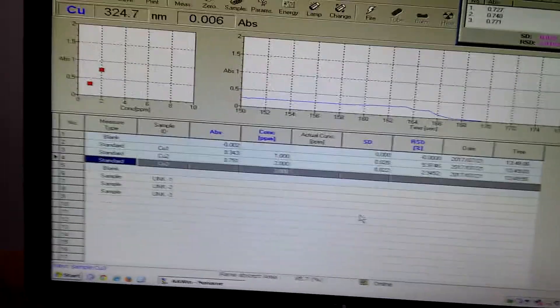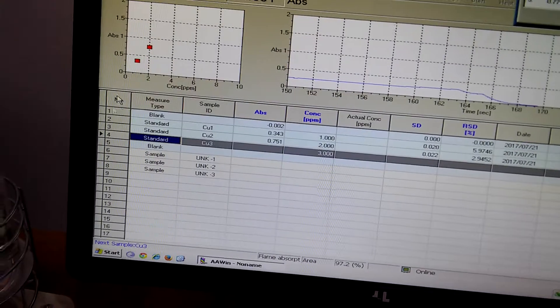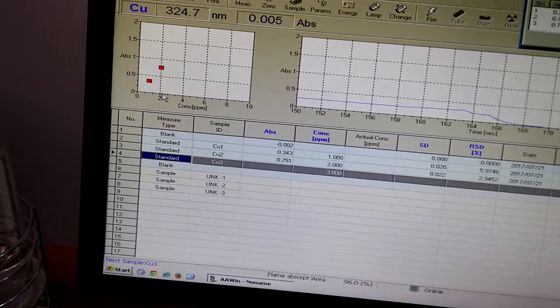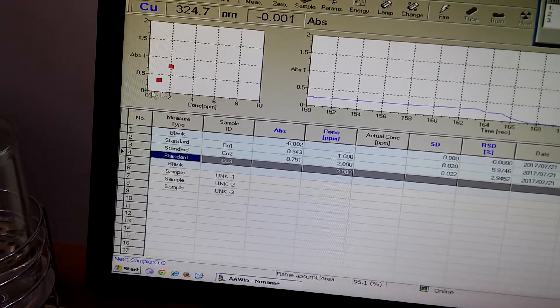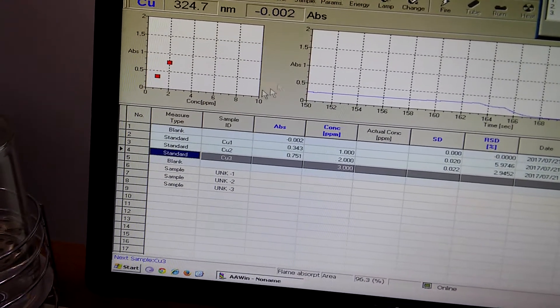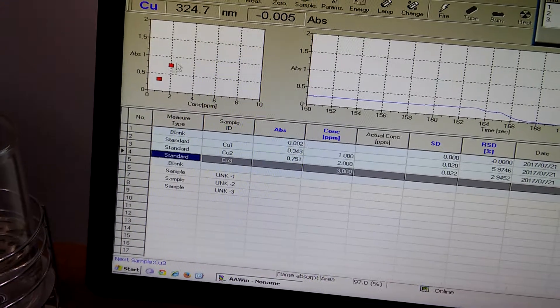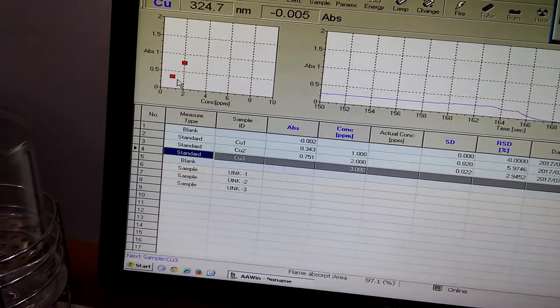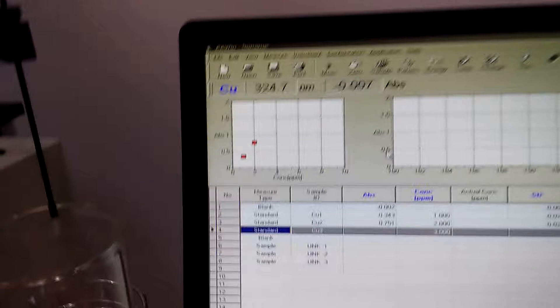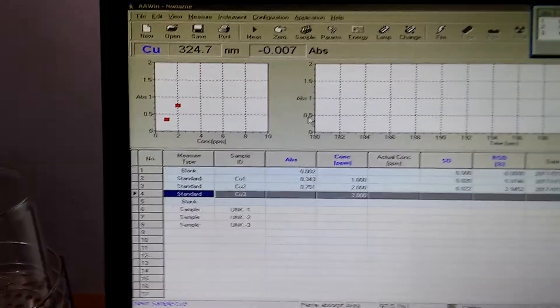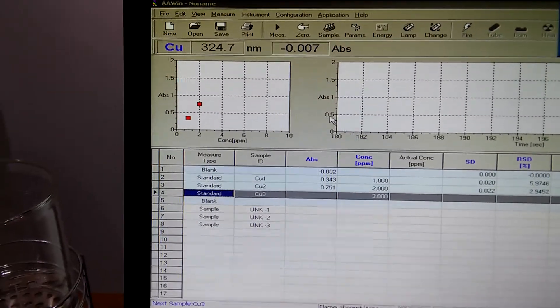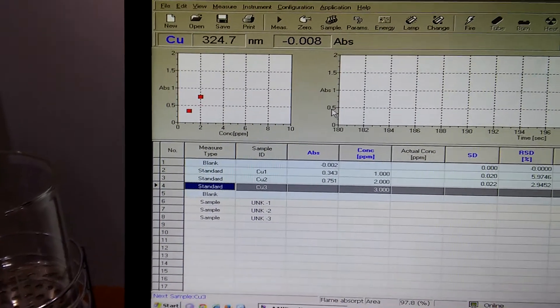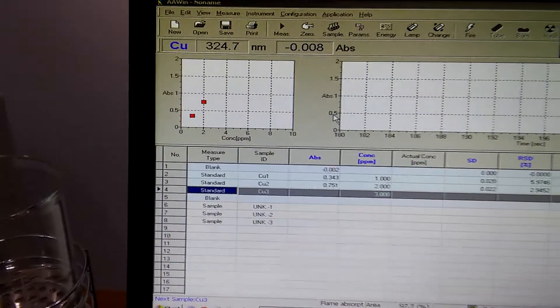As you can see here, the instrument starts to draw the calibration curve. This is the first point, the second, and waiting for the third one to fulfill the calibration curve.